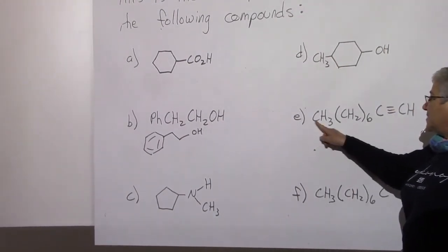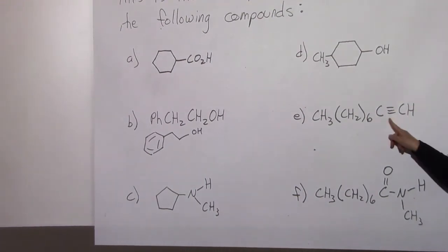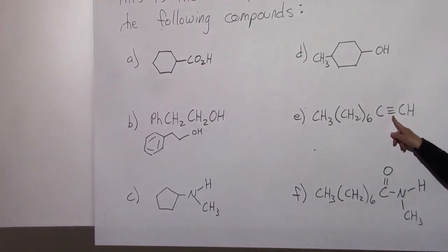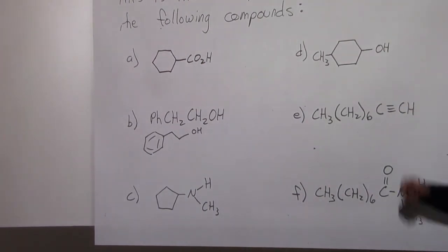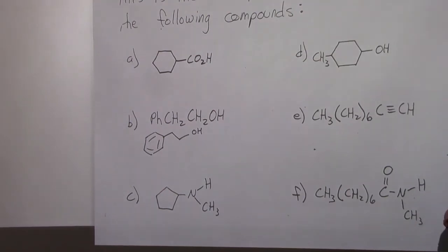And then E, right? E would have a carbon-carbon triple bond in the 2100 region, which I don't see. It also would have that really sharp carbon-hydrogen stretch, 3300 or so, out where the alcohol is, but by shape that is clearly an alcohol and not a sharp, significant absorbance there. So we're going to cross out E.